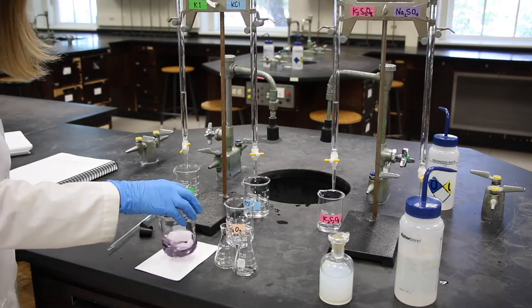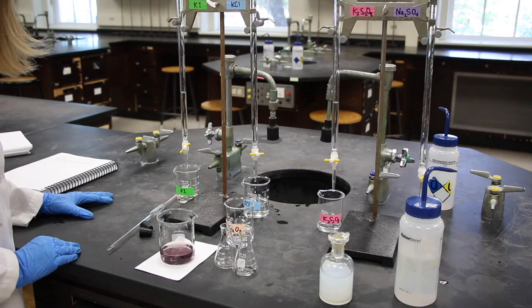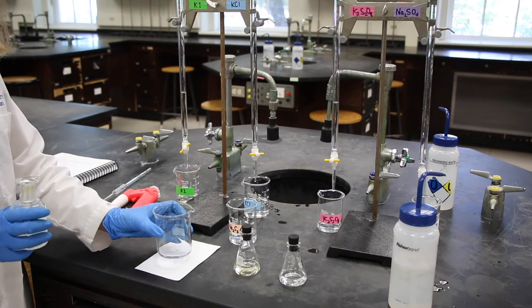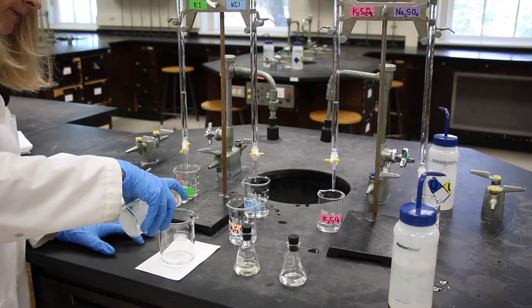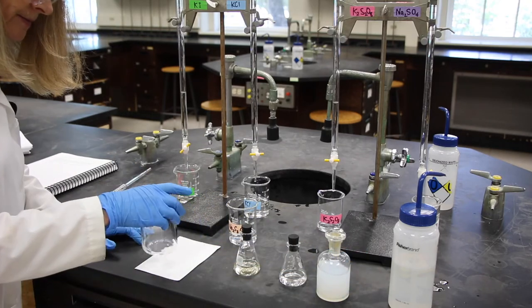Time? 92 seconds. For solution 3, I've already pipetted 10 milliliters of the sodium thiosulfate into our reaction beaker. And I've just added the starch.